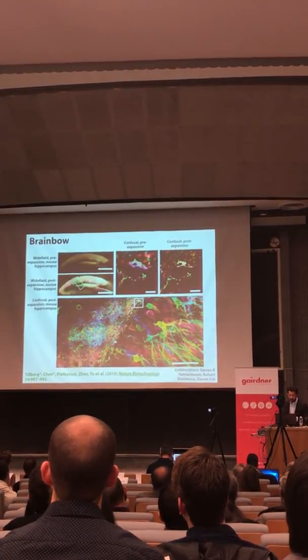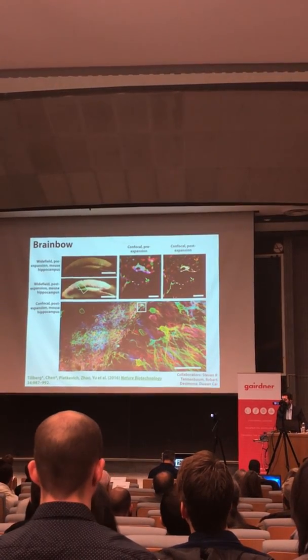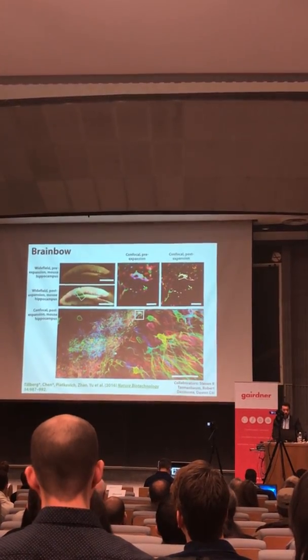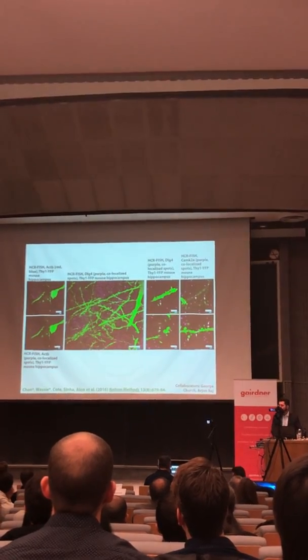other. And so we and others are now working on ways to use the ability to color code different parts of cells and also to color code different kinds of biomolecules to try to build up molecular pictures of how neural circuits are wired. You can use it for other kinds of biomolecules as well.